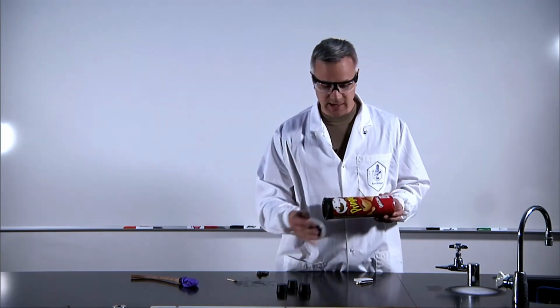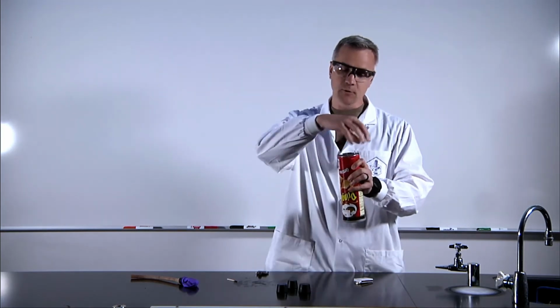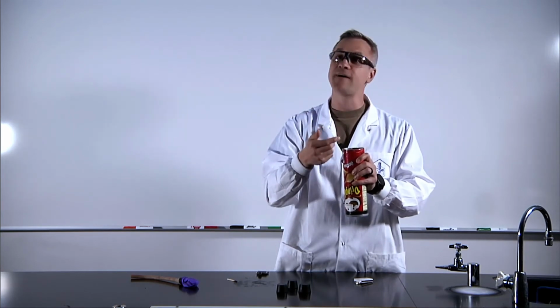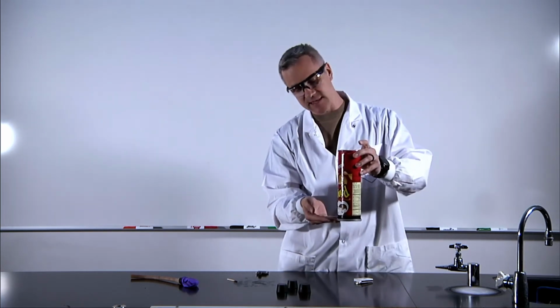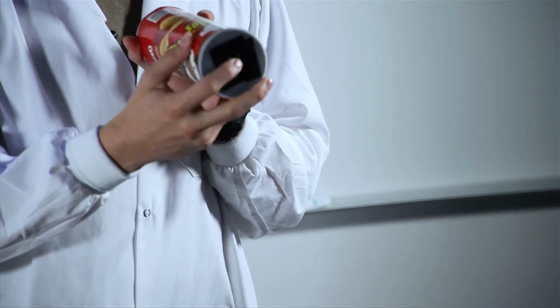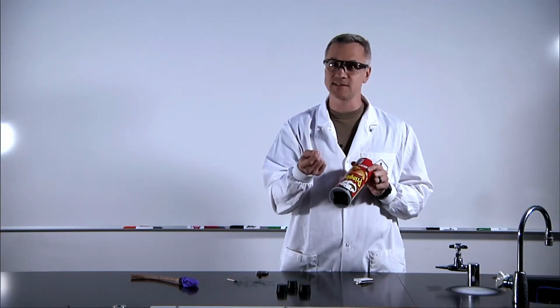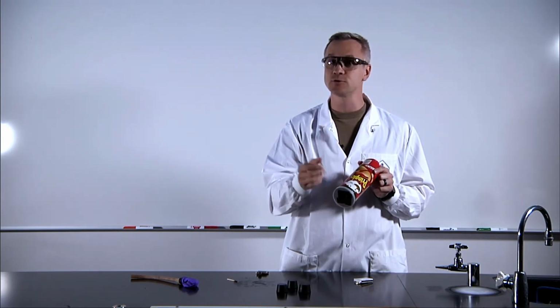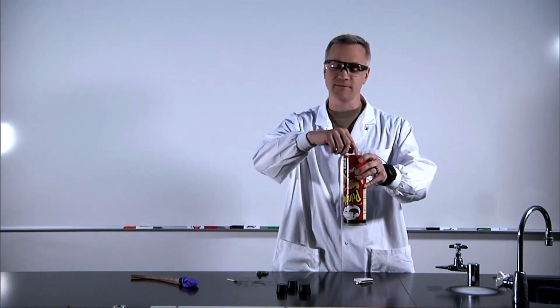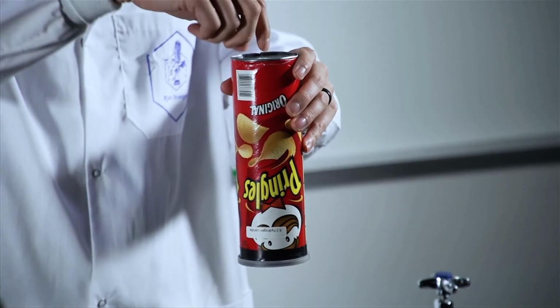Well, not really, okay? But when I initially lit the hydrogen, there was enough oxygen in the surrounding environment for it to keep that fire going. As that was happening, as the hydrogen was moving out of that vessel, what was coming in through the bottom, through this hole? The oxygen was, right? So again, that stoichiometric relationship between the oxidizer and the hydrogen, the fuel source, is very important, right? As the hydrogen was coming out here, you may have seen the fire burning up here. As the hydrogen was leaving this vessel, the oxygen in the environment was keeping that fire lit.